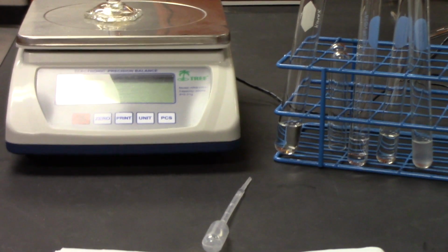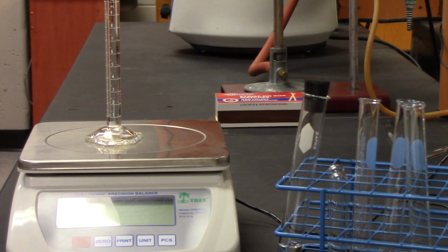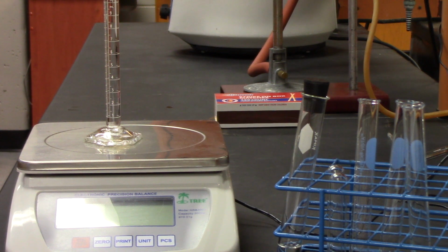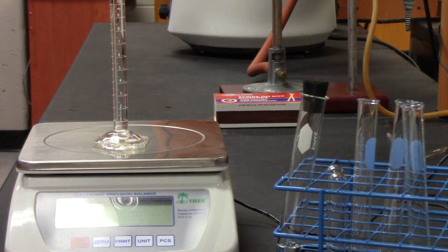All right. Experiment number 2. Part 2 is now we're going to measure the density. And we're going to use a graduated cylinder. Let's see if we can focus in here.